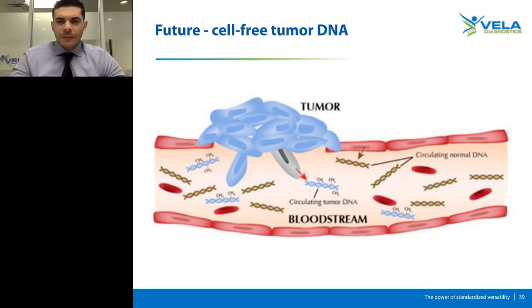So usually what you end up having to do is you cannot do any targeted primer sequencing. You can't really do that with a viral genome because of the variation. You will tend to have SNPs under primers, and if you have primers that are amplifying all these specific regions or hotspots that you're targeting, for HIV maybe over 300 variants, you might have 80, 90 primers or something like that. You're bound to have some SNPs under those primers that might drop out those sequences themselves.